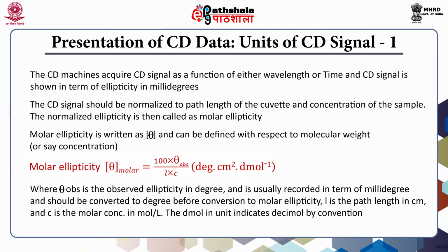L is the path length in centimeters, C is the molar concentration in moles per liter. The dmol unit indicates decimole by convention.